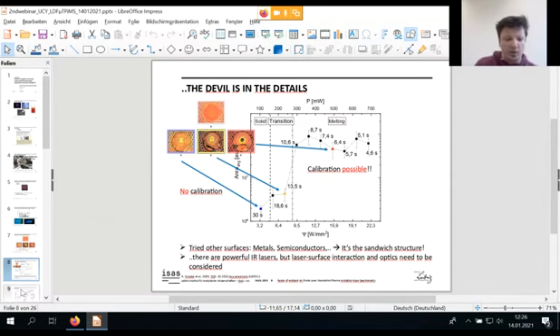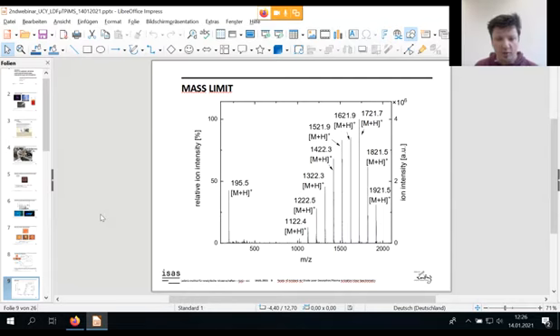We also tried out many analytes. So now we get a little more to the chemistry part here. You may know this solution already. It's quite a popular one. It's a calibration solution. You have some caffeine at roughly 200 masses.